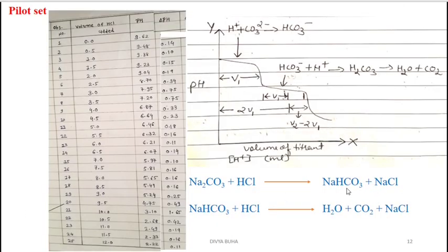So over here we have taken a mixture of two different bases, and we have taken standard acid, okay, and it's a normal acid base titration, wherein first of all Na2CO3 would get half neutralized and the first equivalence point would be obtained.